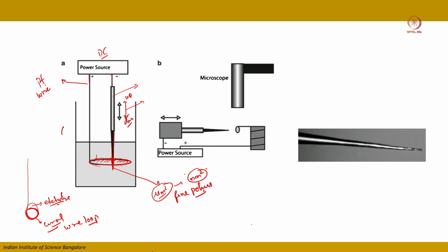Fine. So usually it is not only in the vertical direction, you can actually also do this particular thing in the horizontal direction. And during the electropolishing, if you put up an optical microscope, a high resolution microscope, the thinness of this needle specimen can be watched live. Okay, so this is the basic thing which people are now usually carrying out for the electropolishing.